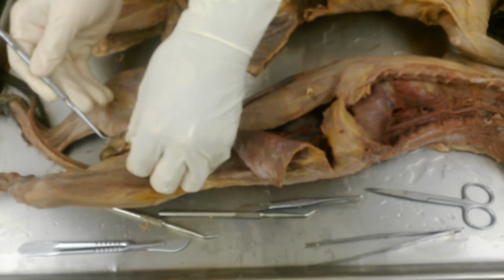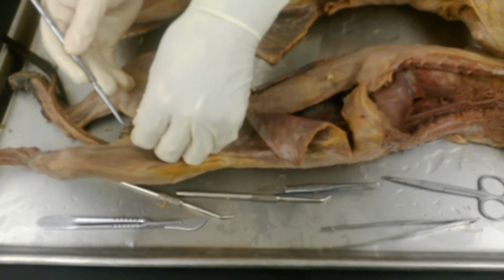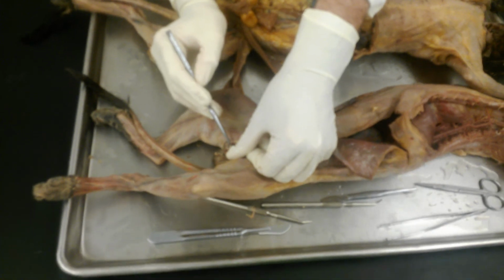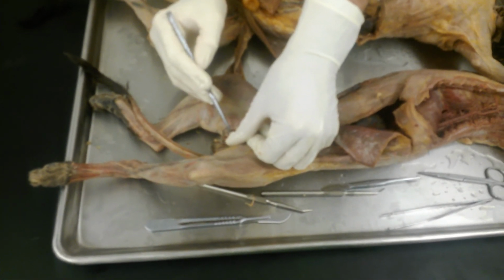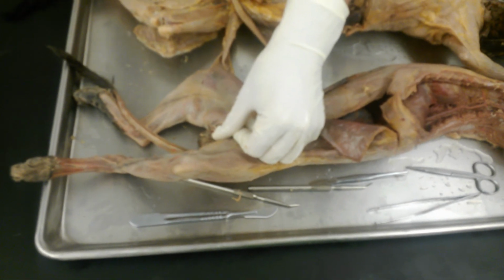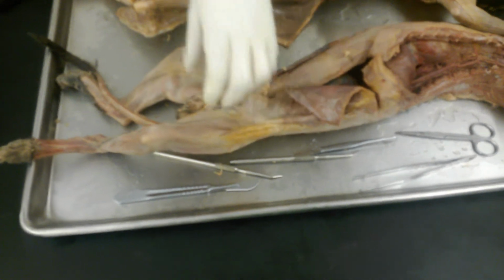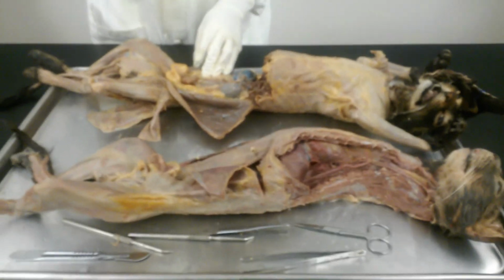And also, I told you in your handout, you're going to cut into the prepuce ventrally to expose the glans penis. And I know you can't see it from there, but if you look at it very carefully, you can see these little spike-like spines that we talked about in lecture that are on the glans penis. Well, I think that's enough to get you started. I'll help you where I can.